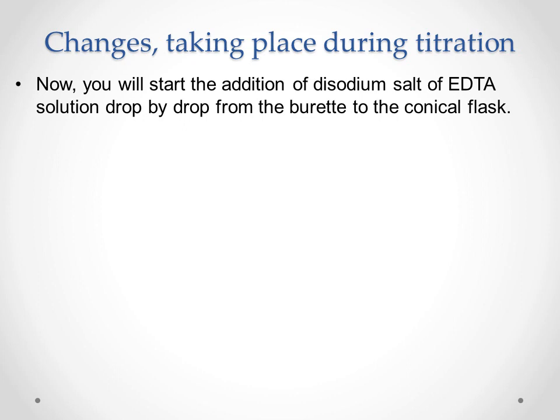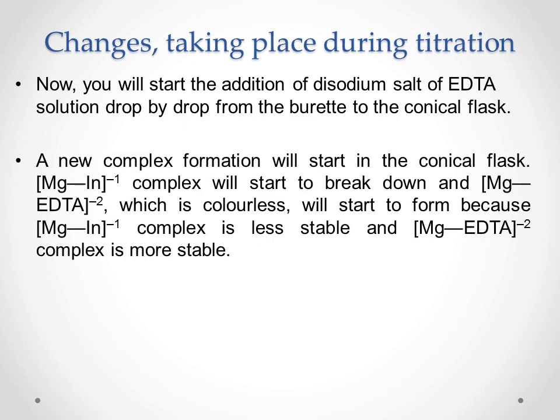After the addition of disodium salt of EDTA solution drop by drop from the burette to the conical flask, a new complex formation will start in the conical flask. The magnesium indicator complex will start to break down and magnesium EDTA, which is colorless, will start to form.